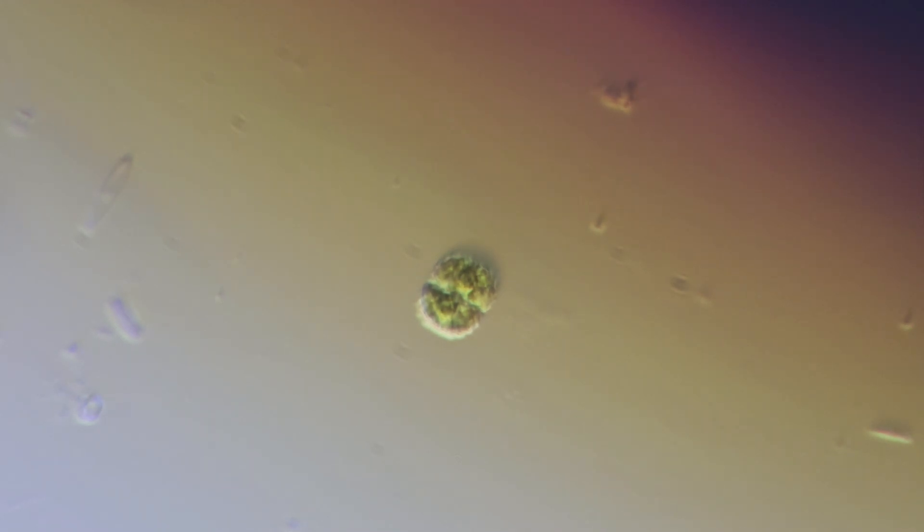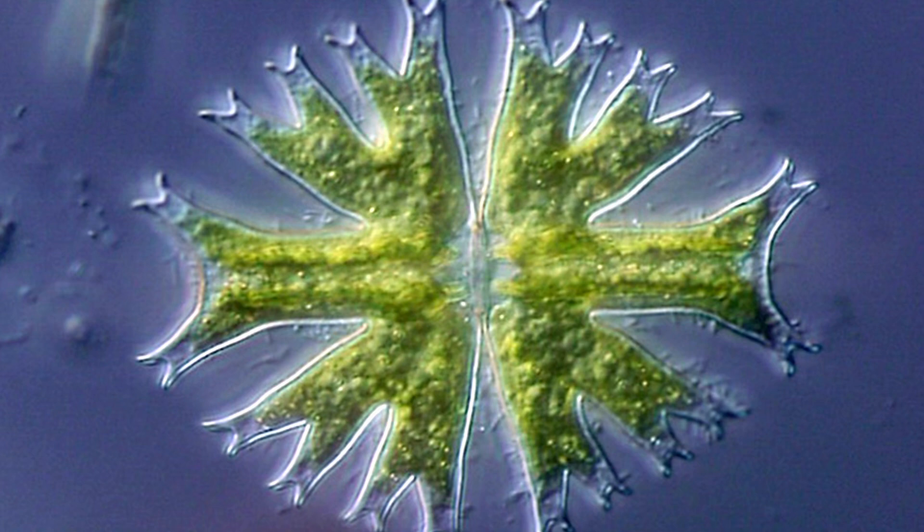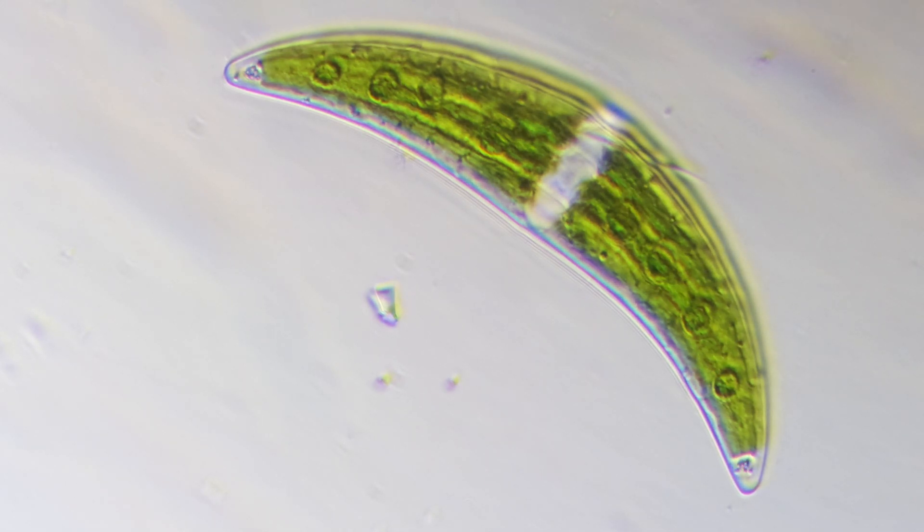Closteriums by and large are lunate, shaped like a crescent moon like this one, but their other desmid cousins come in a variety of shapes, all presenting an amazing and beautiful often complex symmetry. This one, which I also found in my little mesocosm, I believe to be a Cosmarium. And this desmid is called Micrasterias. They can be plain or they can be exceedingly complex in shape, but they are all beautiful.